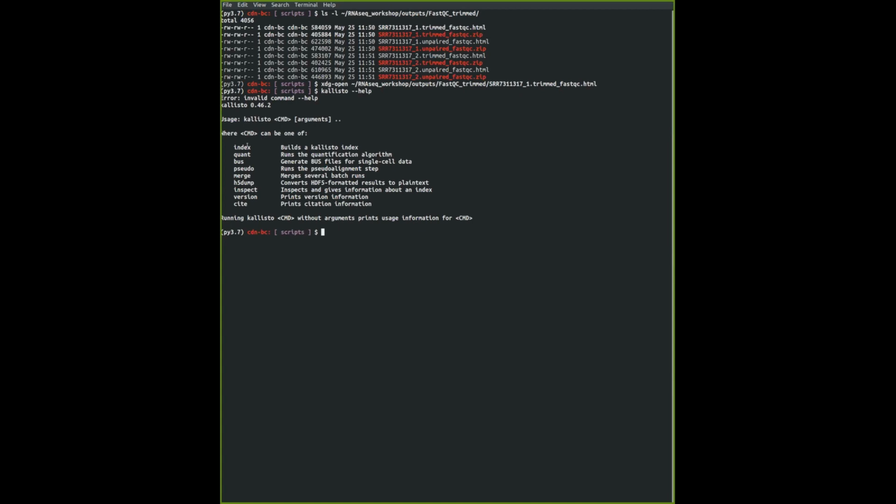So you should begin with, or basically make sure that you have, an index to perform Kallisto. What is an index? Think of an index as the index that you find in a book. If you want to find a particular word in a book, you can refer to this index section that tells you exactly the page that a word is found, and it's exactly what it is.